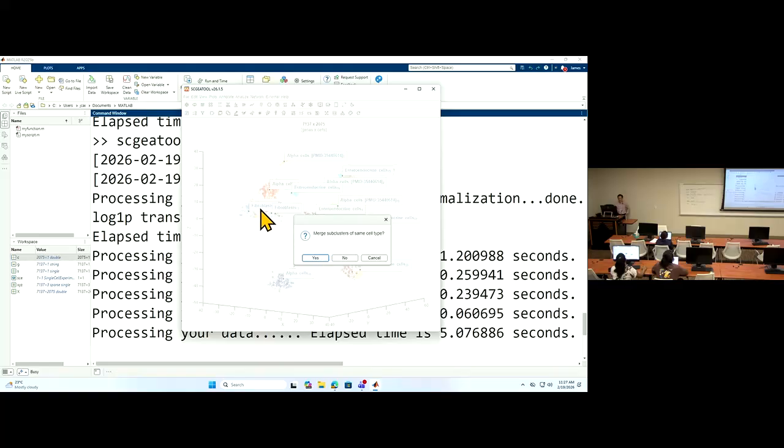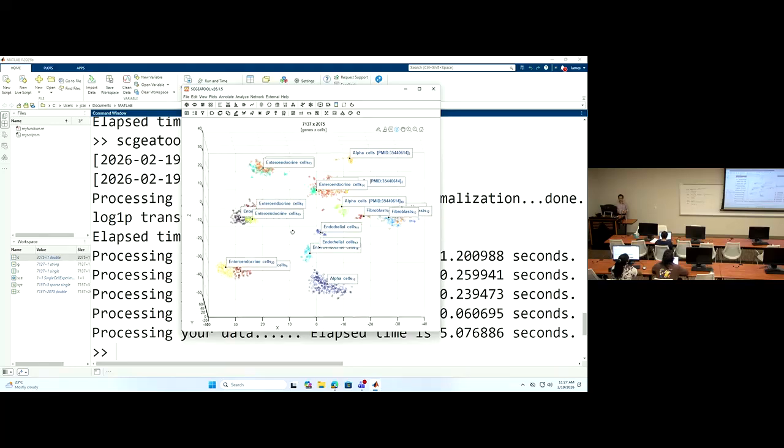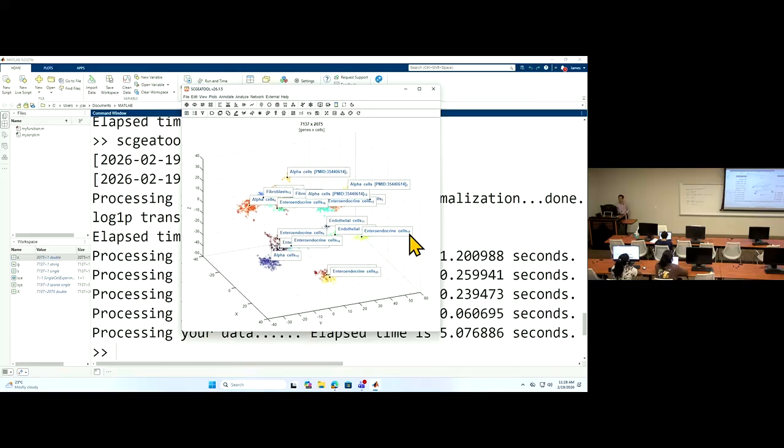Okay, if you have fibroblast 1, fibroblast 2, you can see if you don't merge and you have all these 20 different clusters, because you cluster them into 20, and they all have a different name with an underscore. This is group 19. This is group 20. So this group 8, group 20, they are close to each other.